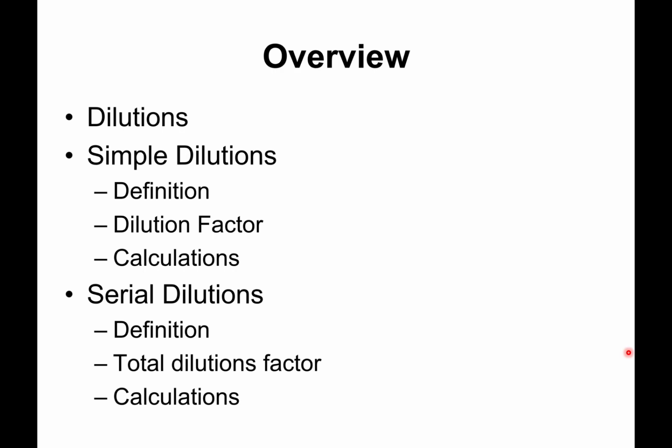What we call simple dilution or one-step dilutions. We talk about what they are. We talk about the dilution factors and how you can do the calculation to calculate the concentration and the volumes needed to prepare them. Then we'll also go through how you prepare them as well.